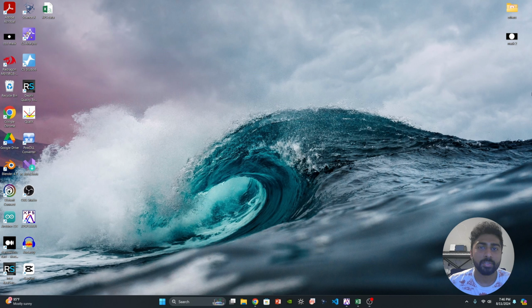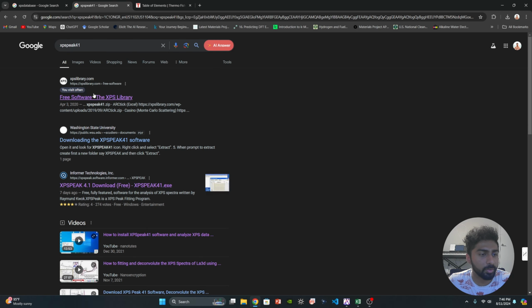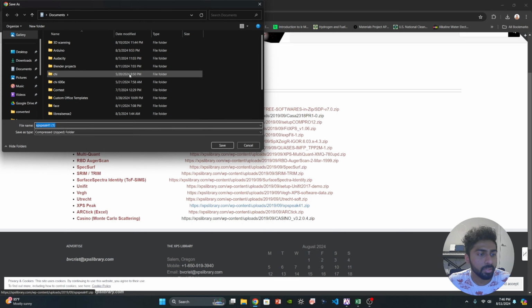Hi everyone. So in this video I'm going to show you how to deconvolute an XPS spectra and then plot it in Origin. The software which I'm going to use to deconvolute is called XPS Peak 4.1 and it is a free software. When you go to the browser and type XPS Peak, you could see this website. Just click it. Once you open that, go to this XPS Peak and the corresponding file. When you click it, it will just go to the downloading page.